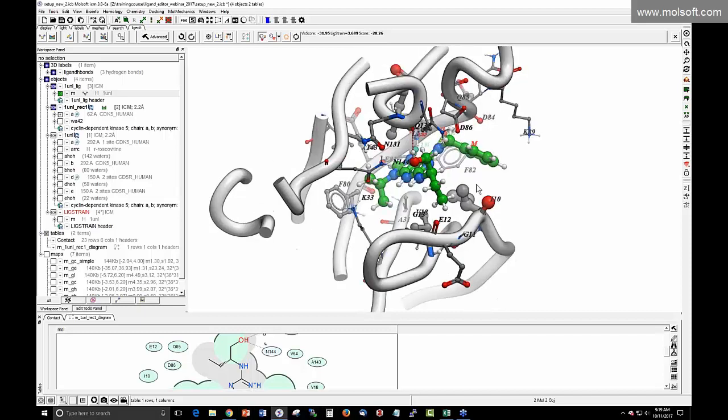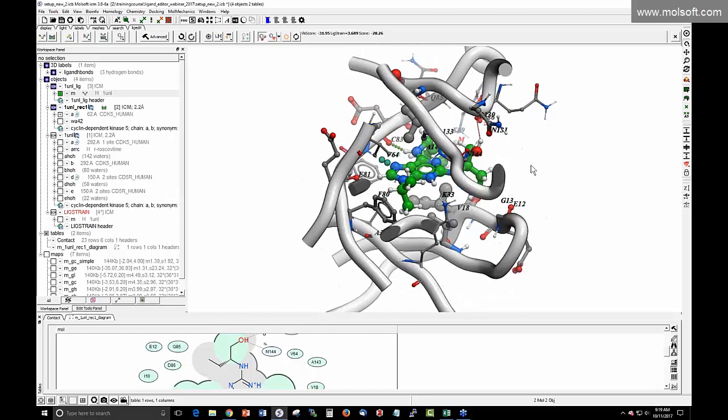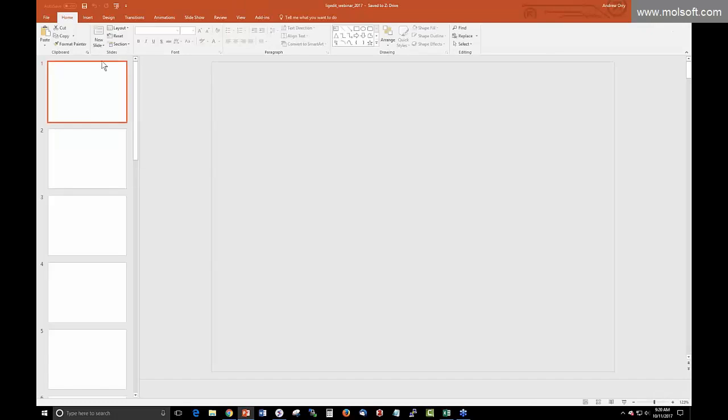So now we've inspected all the interactions, we can have a better idea of where we want to modify. So I'm just going to open up here.